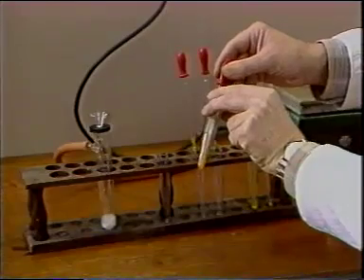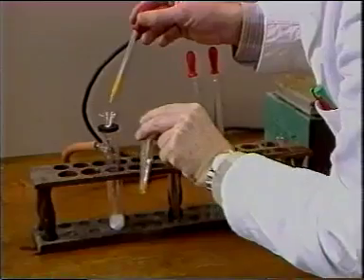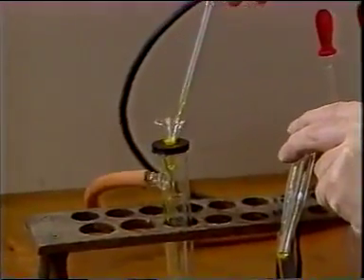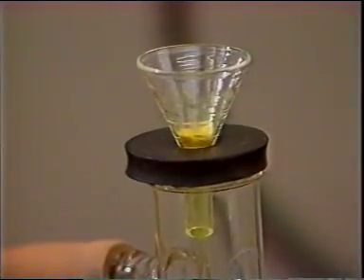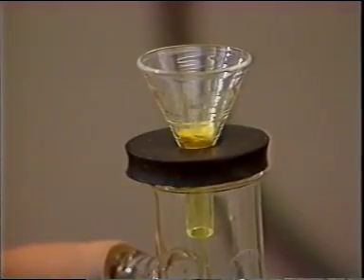The slurry of crystals and mother liquor is transferred with a dropper pipette and the solid is trapped in the space between the filter funnel and the nail head.